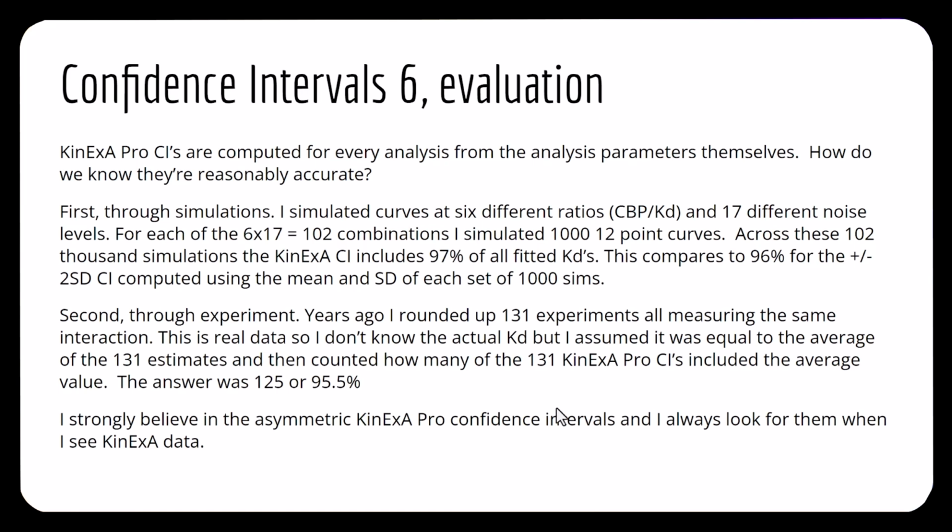And the second is through experiment. I rounded up 131 experiments that all measured the same interaction. And these data were spread across multiple KinExA instruments by multiple different operators over a period of more than a year. But I had 131 of them all measuring the same thing. And this is real data, so I don't know what the actual KD is, but I assumed it was equal to the average of the 131.